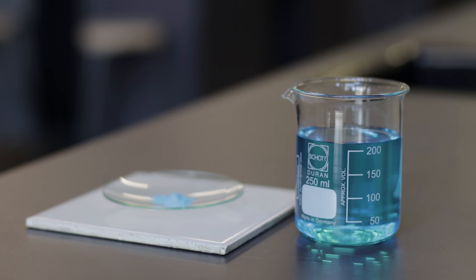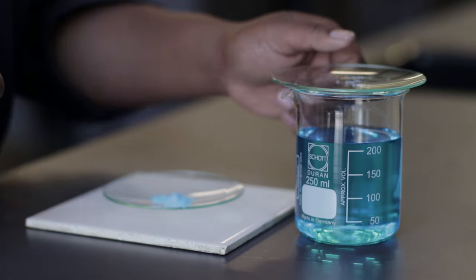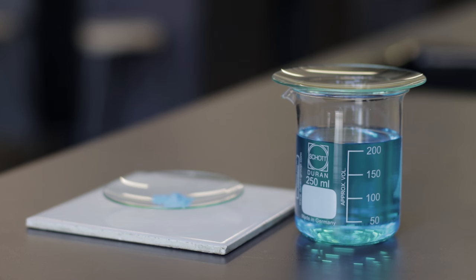A watch glass is a circular concave piece of glass. It can be used to cover the mouth of the beaker or to weigh out a solid in the absence of a weighing bottle.